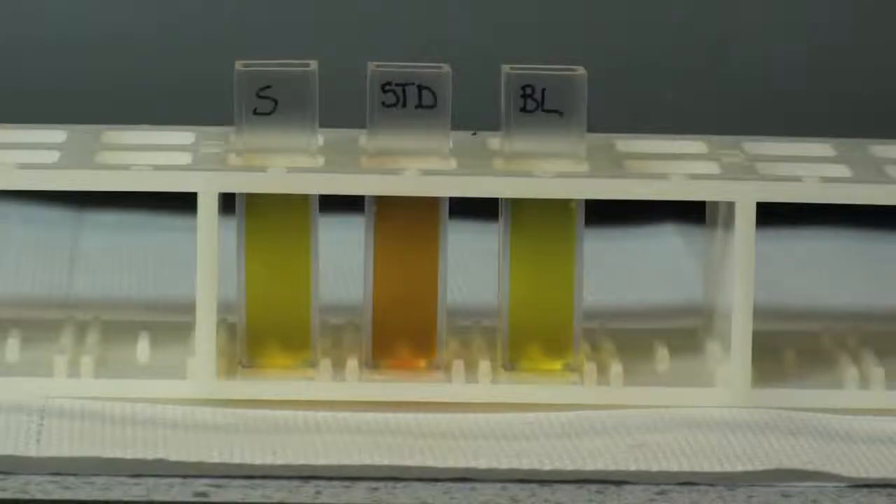Here we have examples of the tartaric acid colour development with sample, standard, and blank. Samples containing high levels of tartaric acid will generate a high degree of colour development. In this case, the sample has very low levels of tartaric acid, while the standard has a high level of tartaric acid and therefore a high degree of colour development.